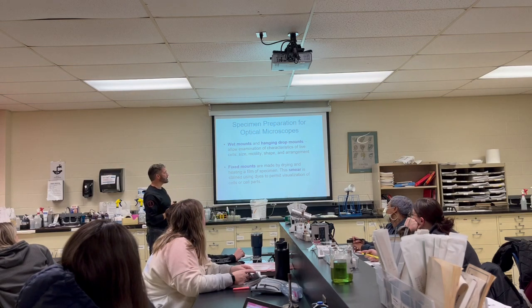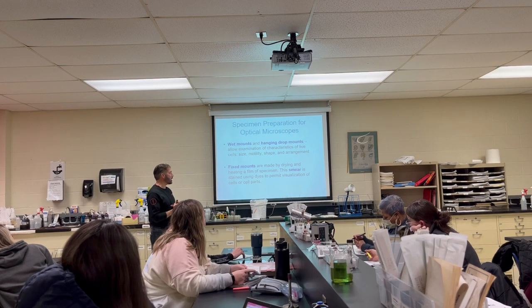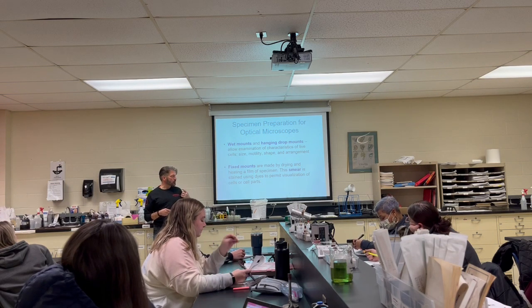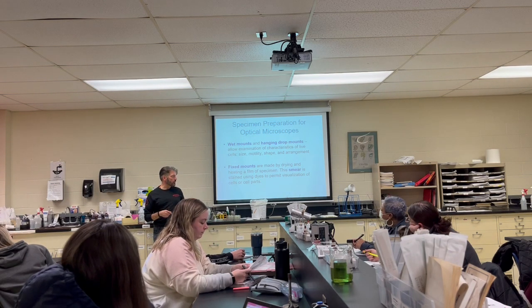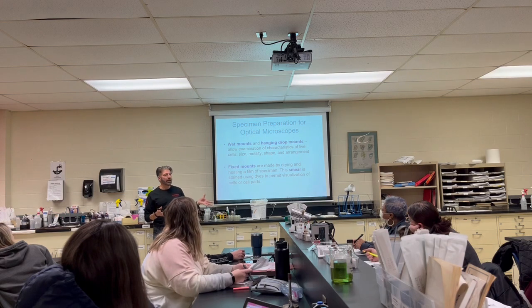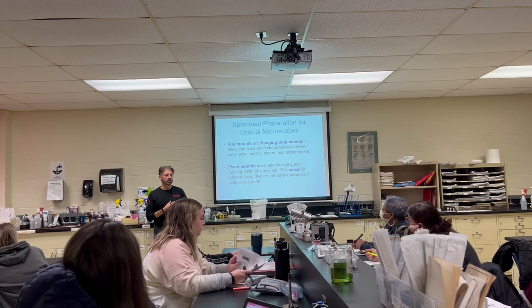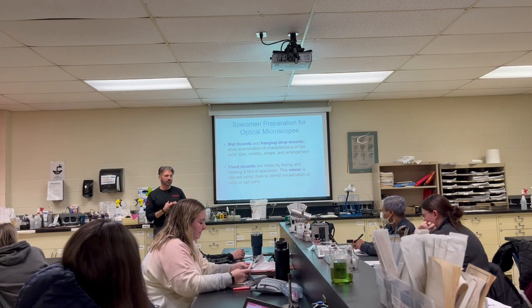The smear is stained using dyes for visualization of cells or cell parts. Initially when I taught the course, Dr. Rowe told me, here's some slides, we'll heat fix them, have the students look at them. They were not stained. How do you think that went after about an hour in lab? I was ready for a drink because I couldn't even find stuff on there.